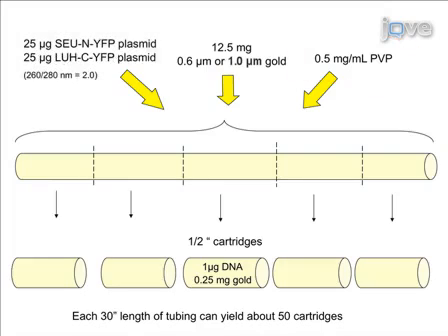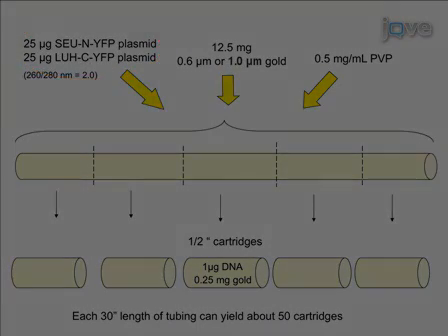For BiFC, combine in the same cartridge preparation the two plasmid DNAs of the putative interacting proteins: SEU fused to the N-terminal half of YFP, abbreviated SEU-NYFP.